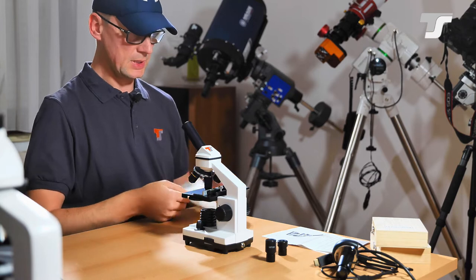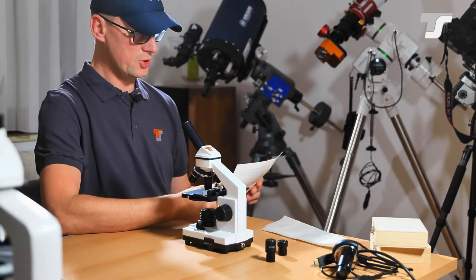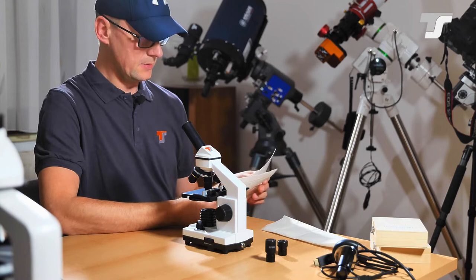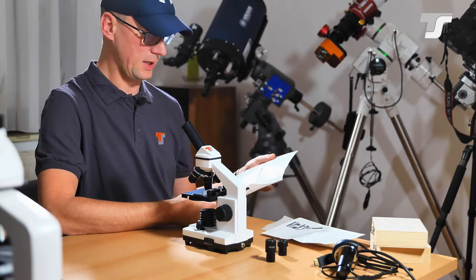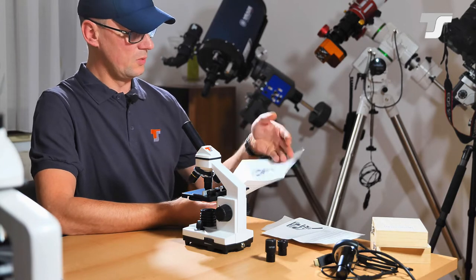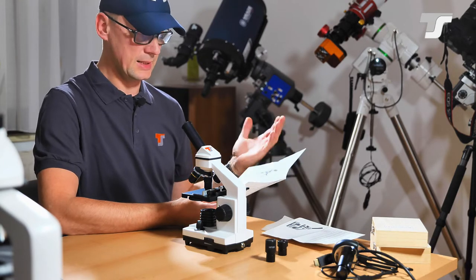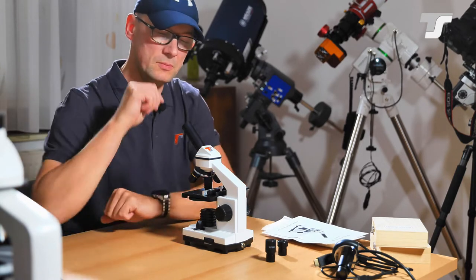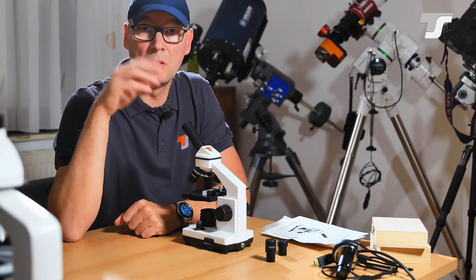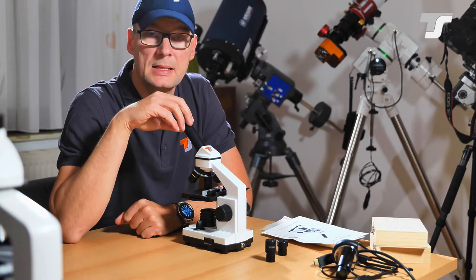And last but not least there are two manuals with it. One English, one German. To get started with the microscope so you get an idea what all these pieces are. But I will also talk you through the pieces. So that's all what's in the box. Now let's get started.